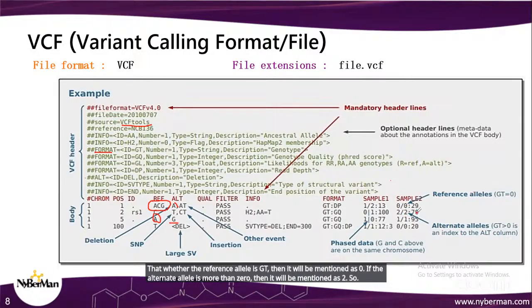So this is the technique that will be handled by the mutation analysis tools. Okay, so you don't need to worry about or understand these particular numbers. You just need to focus on your chromosomal location, the first 4 or 5 columns that we have here, where we need to understand chromosome location, position IDs, reference nucleotides, and the alternate or altered nucleotides, so that you can see what type of mutation has happened and whether these mutations are involved in the disease or not.